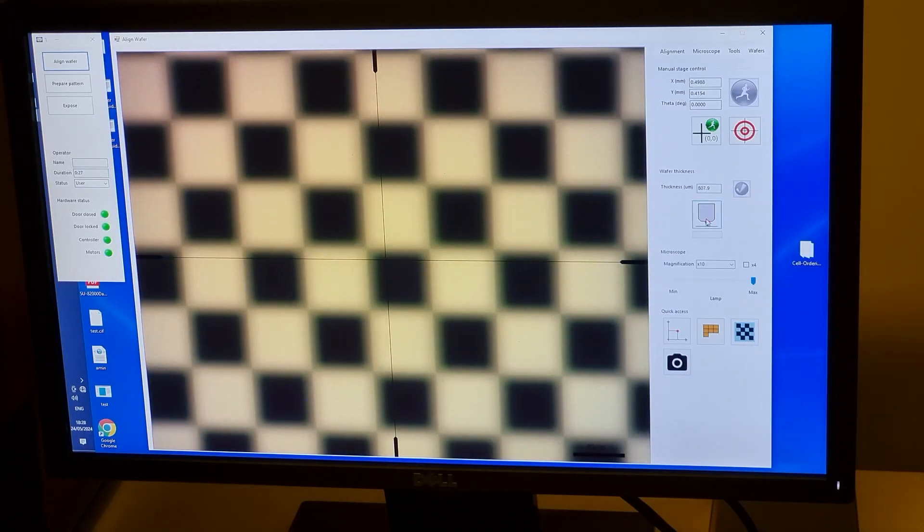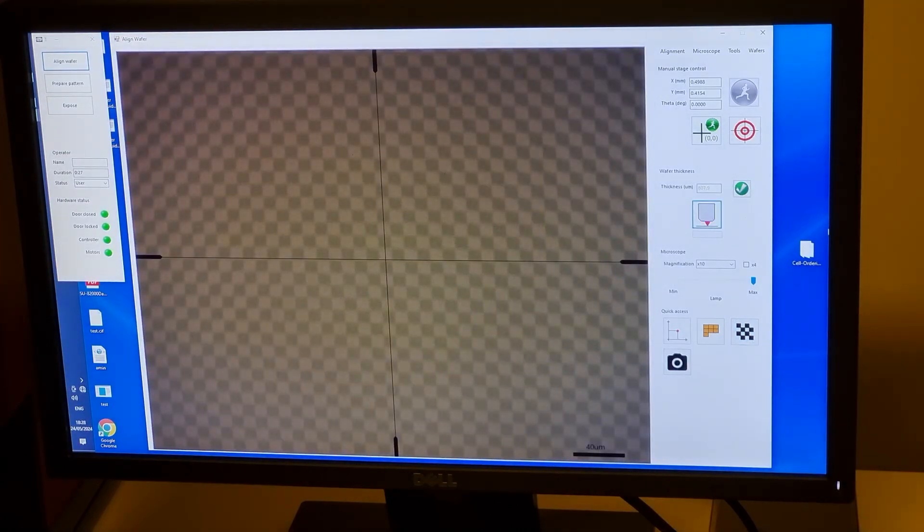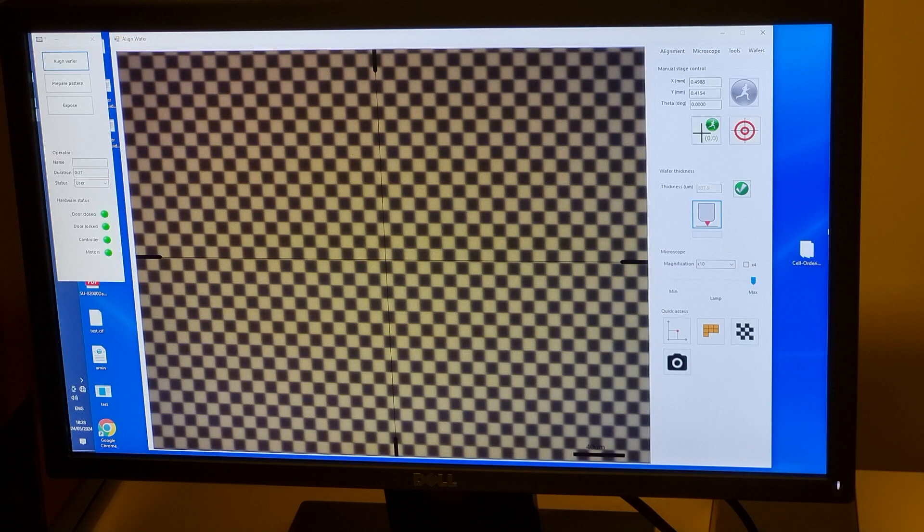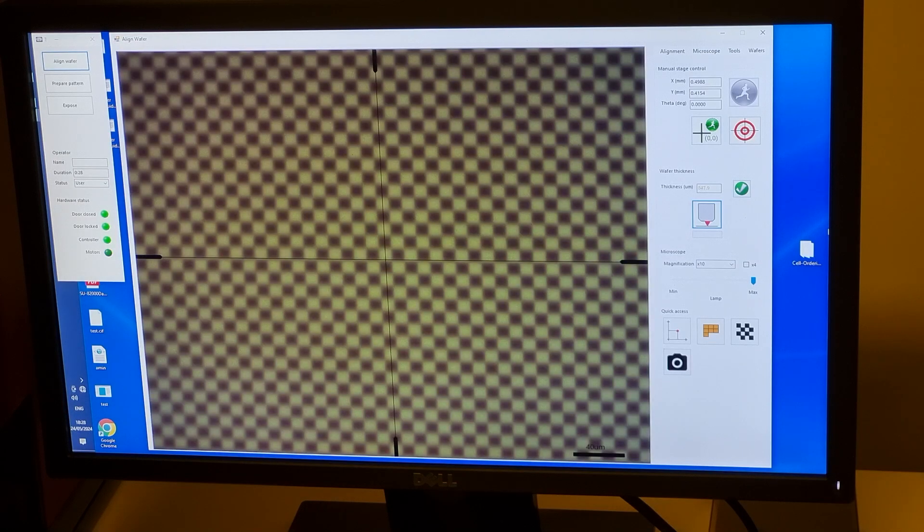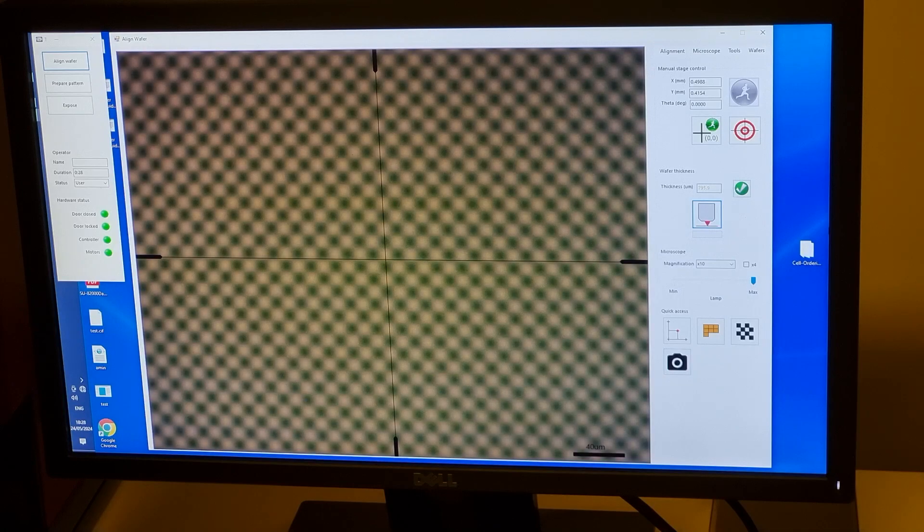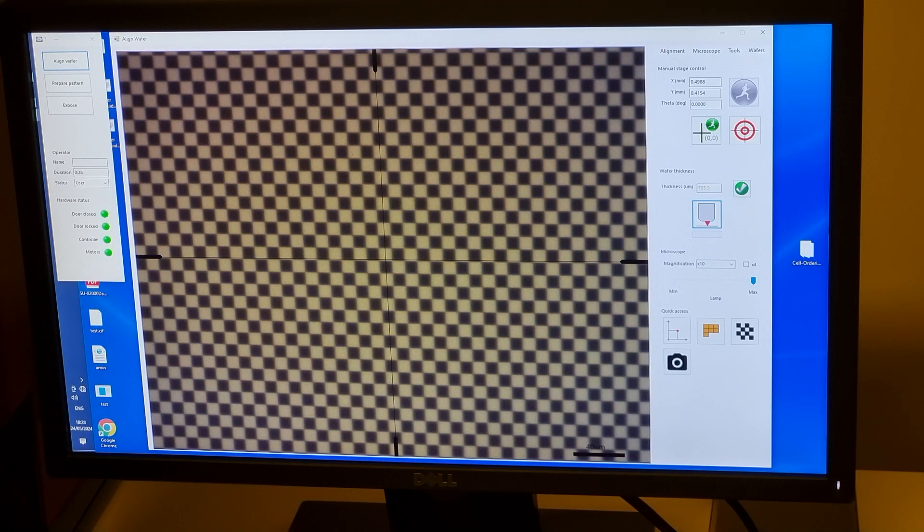The software requires you to do an autofocus step. The button just below the wafer thickness box with a red triangle in it will start the autofocus procedure. If you have a thick film, a transparent substrate like a glass slide, or a highly reflective film, you need to think carefully about which surface the microscope is actually focusing on, as it can focus on any reflective surface, including the top of the resist and the bottom of the glass slide.